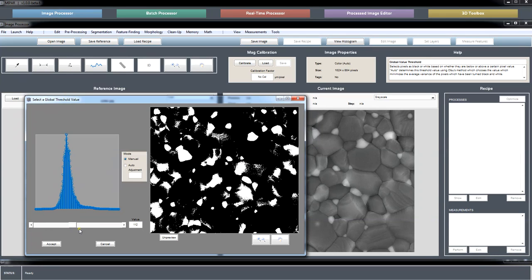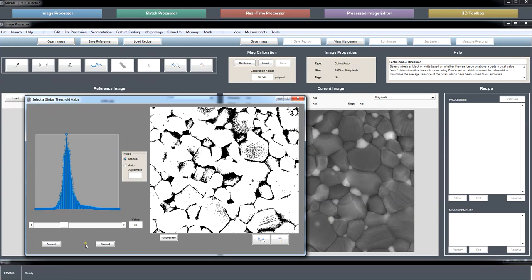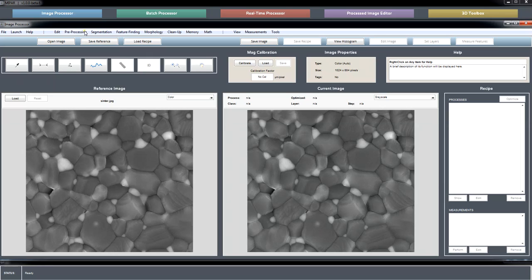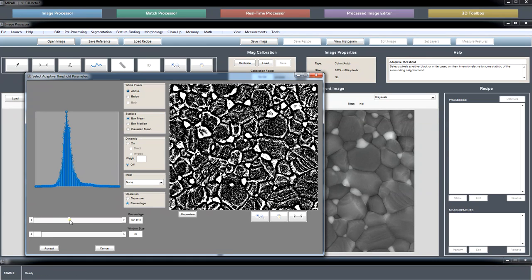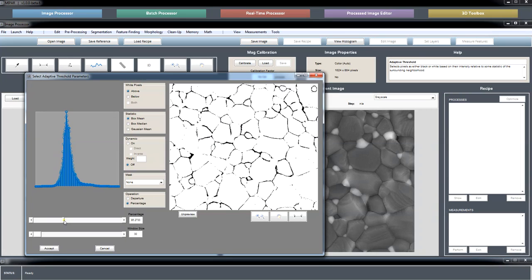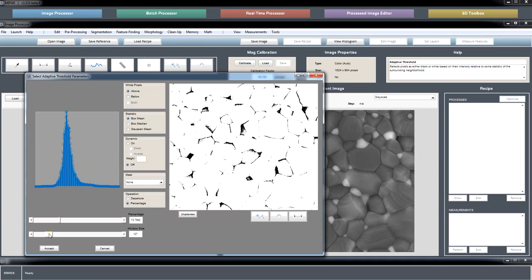A number of you are familiar with the common interface here. You do have help for every item that you select. Some of these are starting to be tool-tipped. They'll all get filled out very soon, hopefully in 7, possibly in 8.